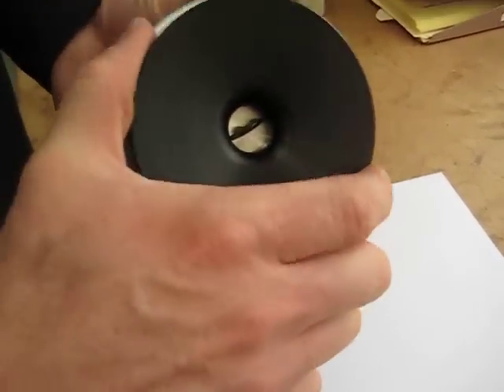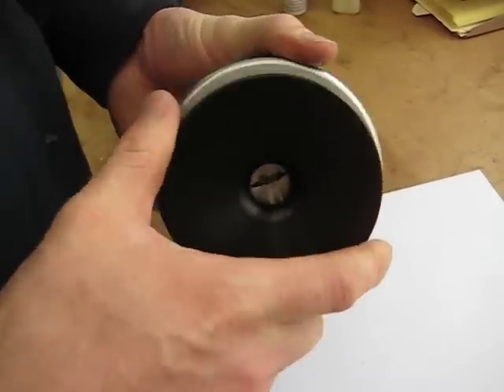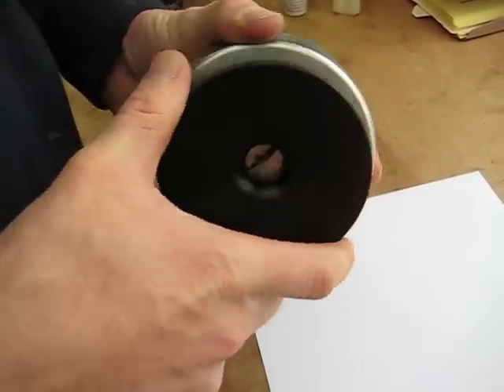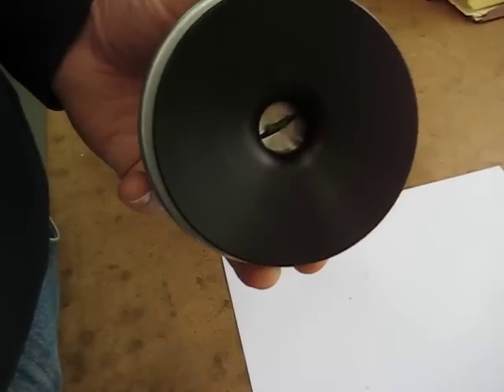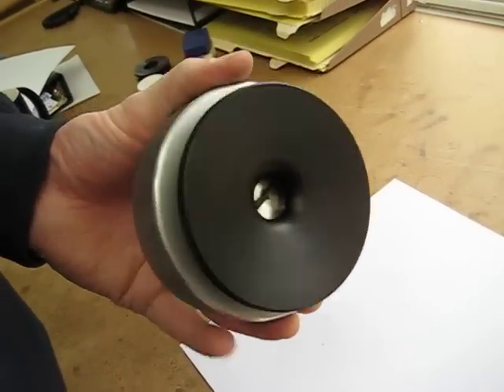Then just begin to twist the compression gland to put pressure on the gasket to tighten down around the sample. You can see it's completely sealed there. Then you're ready to put that on the chamber and take the reading.